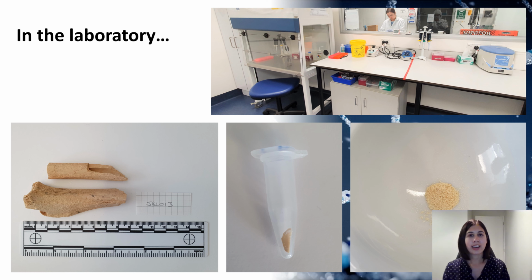So when I'm working in the lab as a technician, I help researchers with their ancient DNA projects. We start out with bone samples like the ones on the left, which have been collected by archaeologists in the field. We then take a very small subsample of less than 0.1 grams and we grind that into a fine powder.